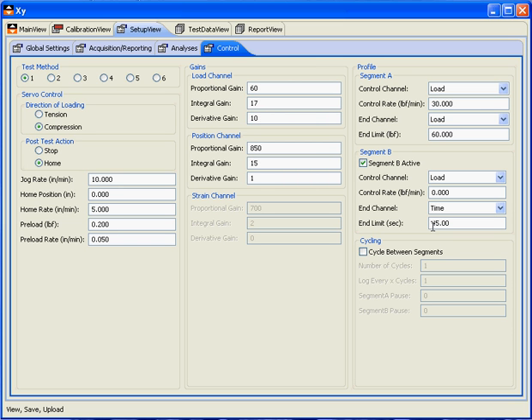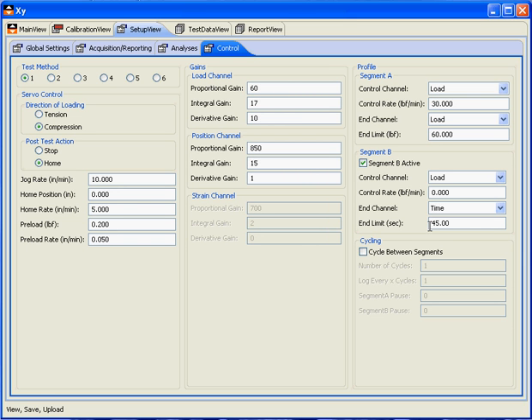So basically, in this test, we'll run at 30 pounds per minute, up to a load of 60 pounds, and then in which we'll go to Segment B and hold that load of 60 pounds for 45 seconds.